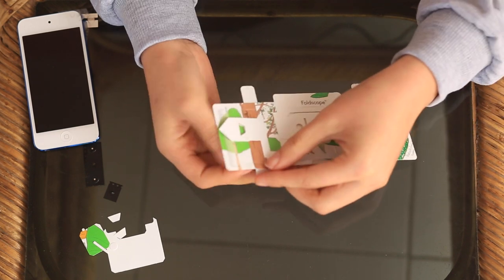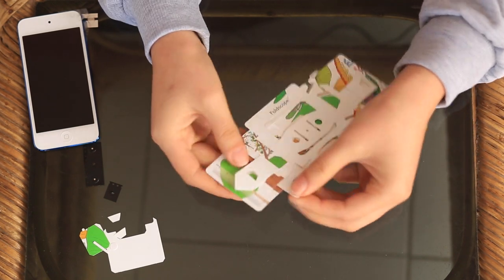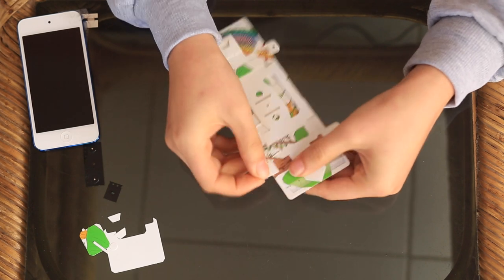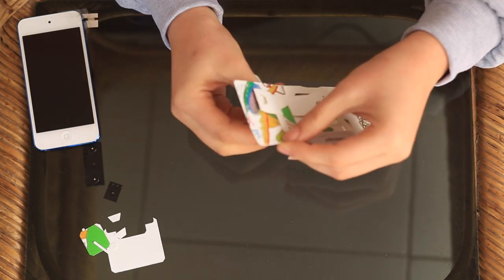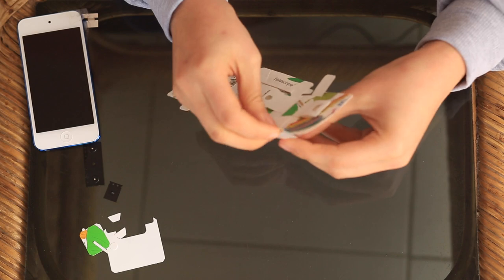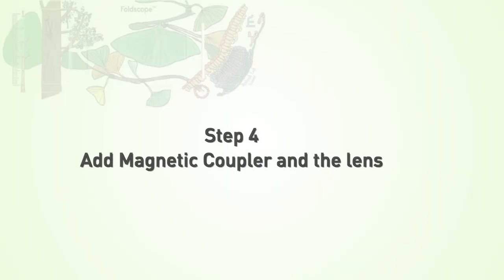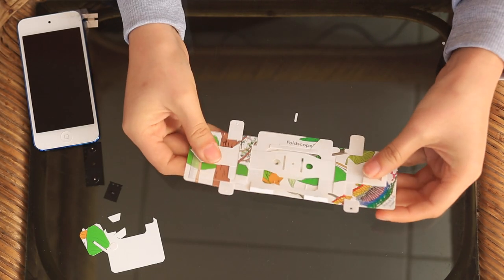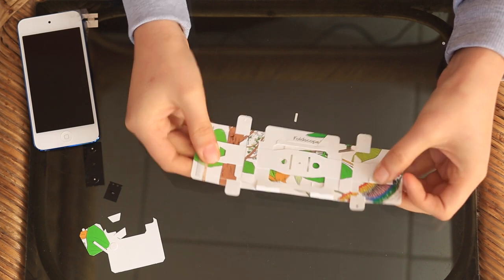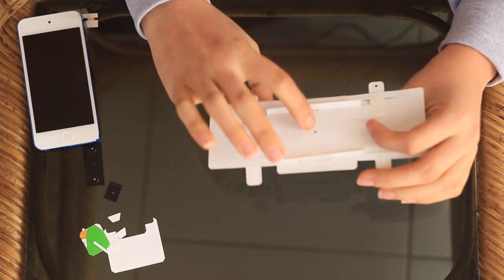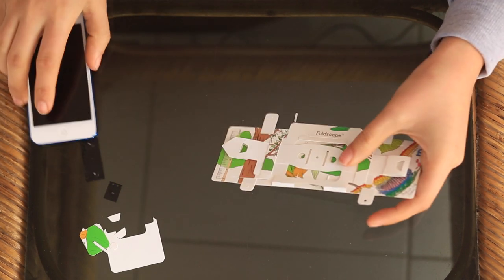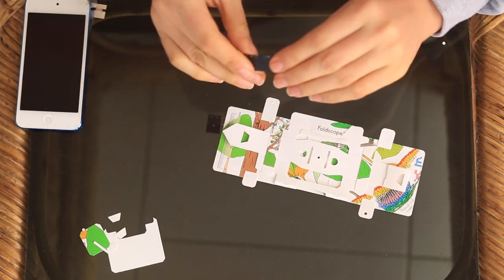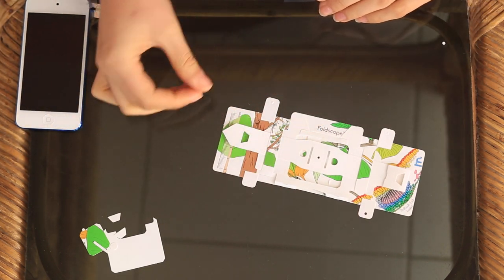The last step that we do is we put all the little arms through there, through there, through there. So this is a Foldscope that's completed, completely folded but it doesn't work right now. You can see all the way through it but you need to put in the light, the magnetic coupler and the lens.